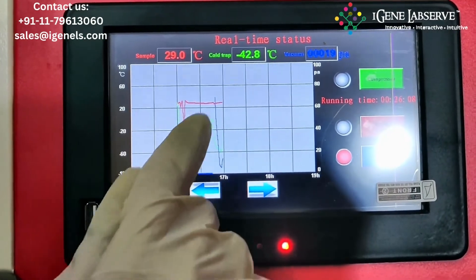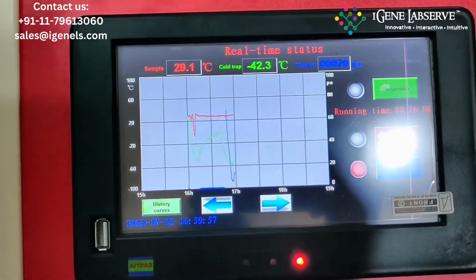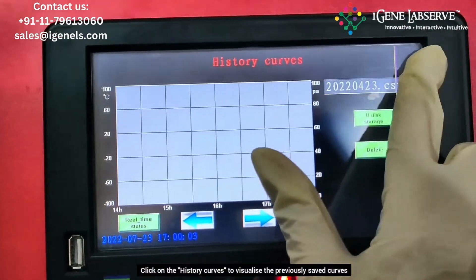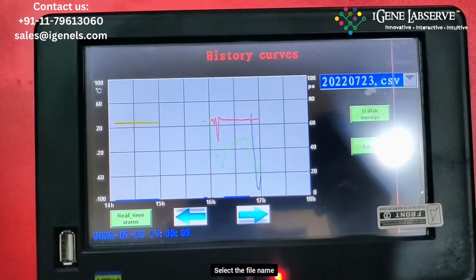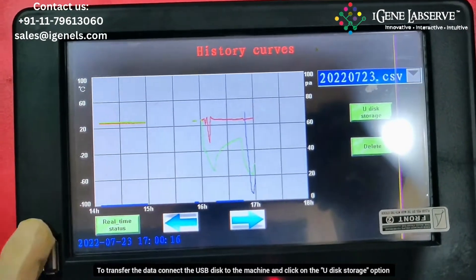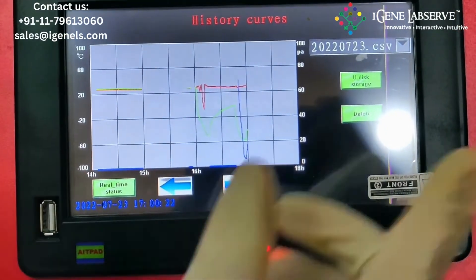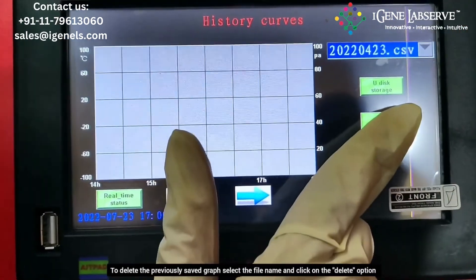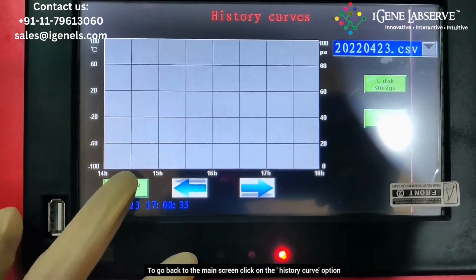Here it displays and generates a real-time curve according to the sample temperature, cold trap temperature, and the vacuum pressure inside the chamber. To visualize previously saved curves, you have to go to history curves. Here you can select and open previous curves. To transfer the storage data to your USB disk, put in the USB disk and click on USB disk storage to transfer the data. To delete any curve, select the particular data and click the delete option. To go back to the real-time status, click on the real-time status again.